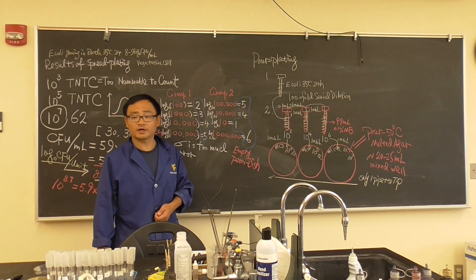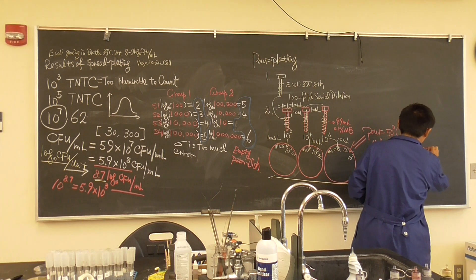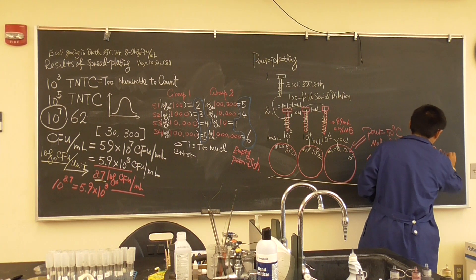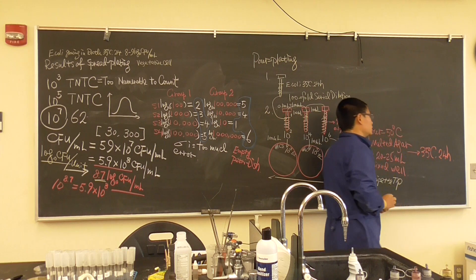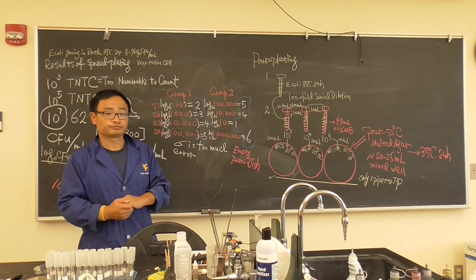Today don't flip it over. And then we will incubate 35 degrees Celsius, 24 hours. Next third Tuesday, you will see the results. But don't flip it over.